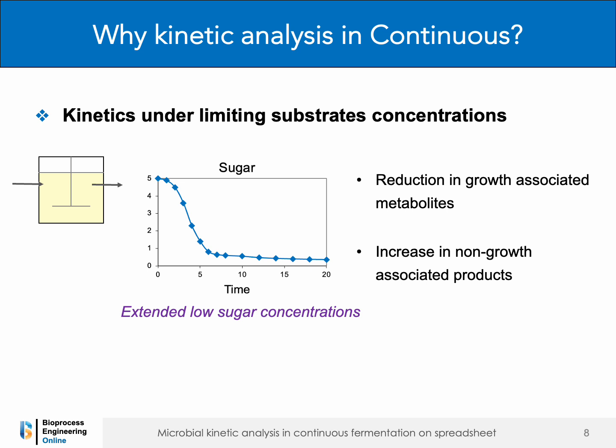Continuous fermentation provides an effective way to study these phenomena, as it allows the cultivation of microorganisms under controlled and steady low substrate conditions for extended periods.